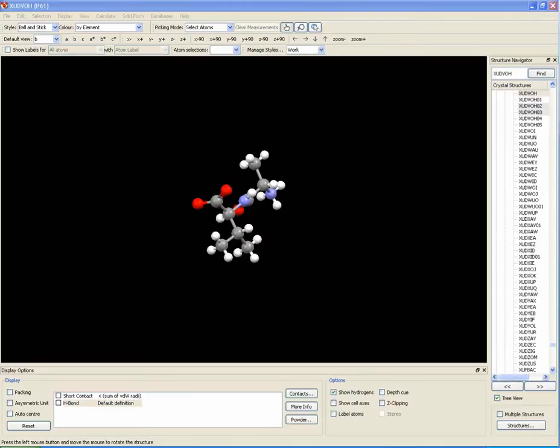How to visualize the void space in a structure. You can use the void option to visualize the void space by doing this.